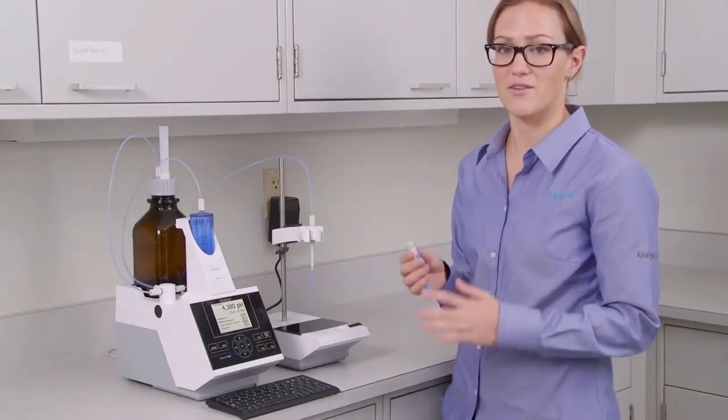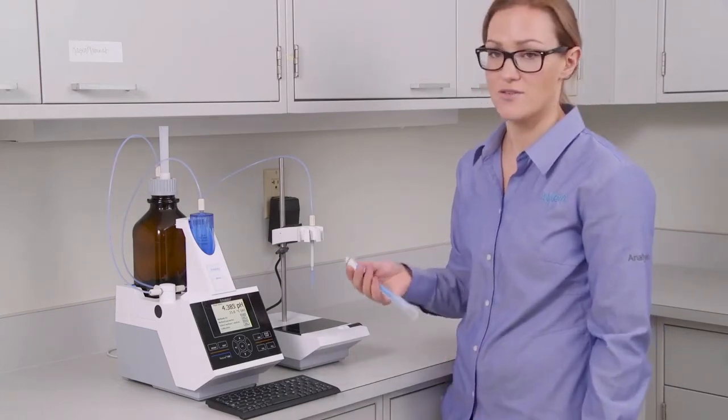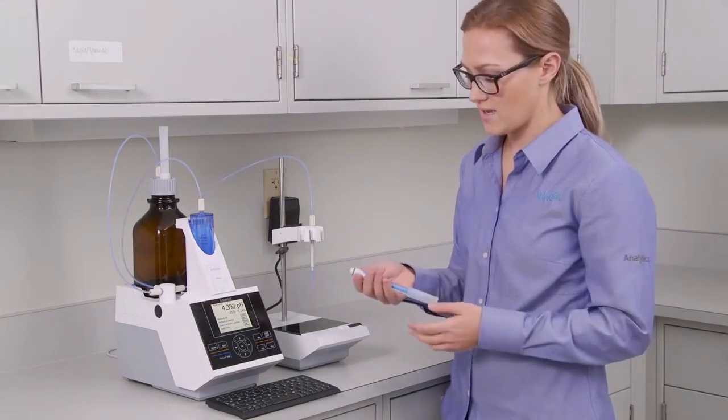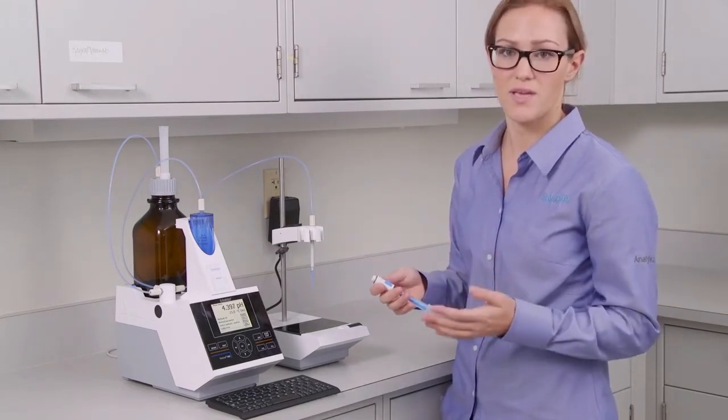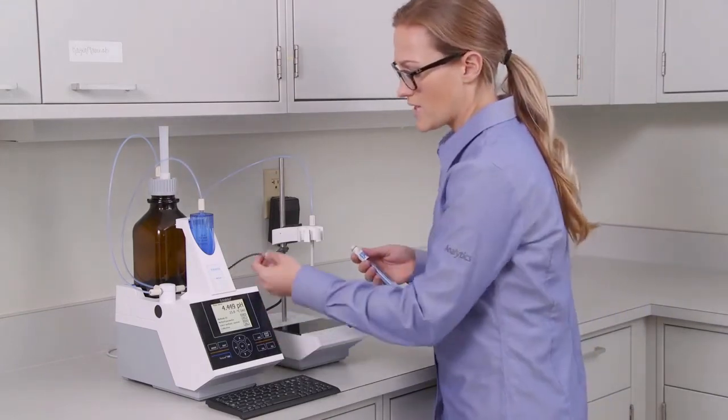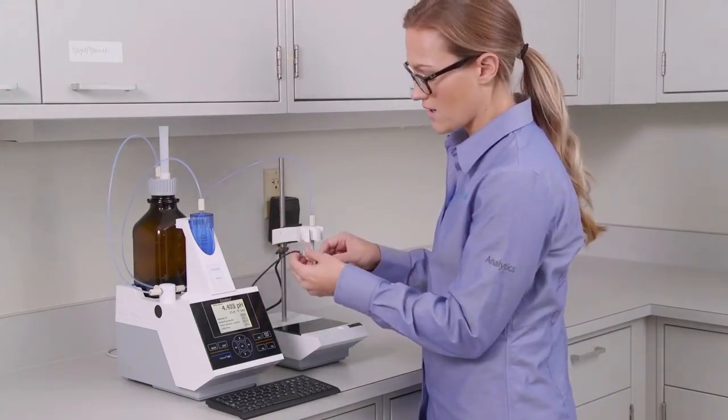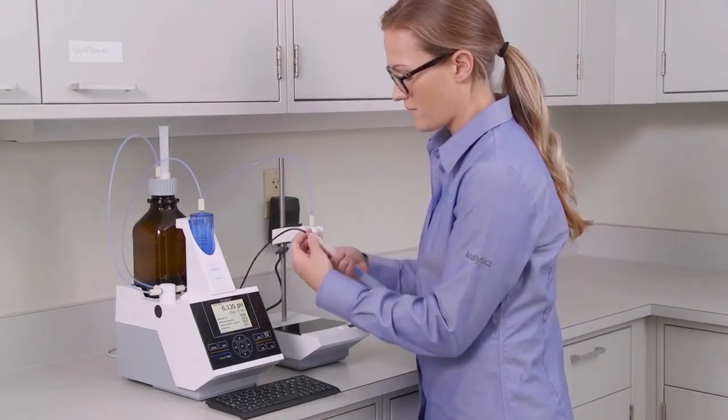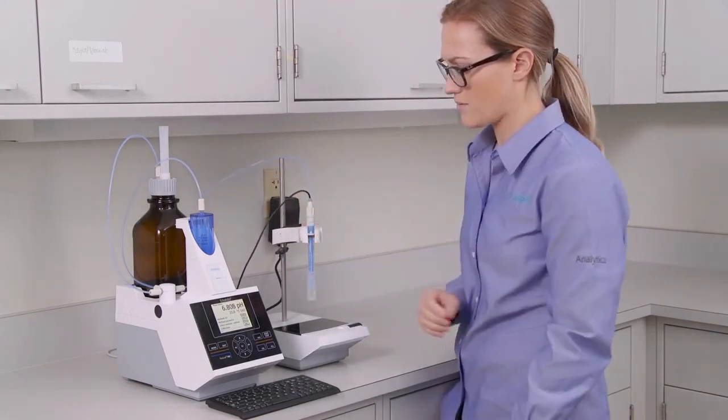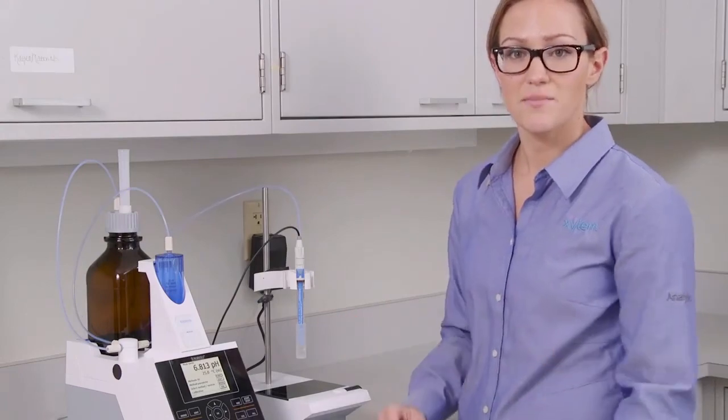The final step to getting your complete titrator setup is your electrode. Now you may be using a number of electrodes. In this case we're just going to be working with a simple pH combination electrode - this is our blue line 11. You'll take the other end of your electrode cable and just connect it to the top of your probe. And you'll take your probe and put it on top of the clamp like so. And it's as simple as that.